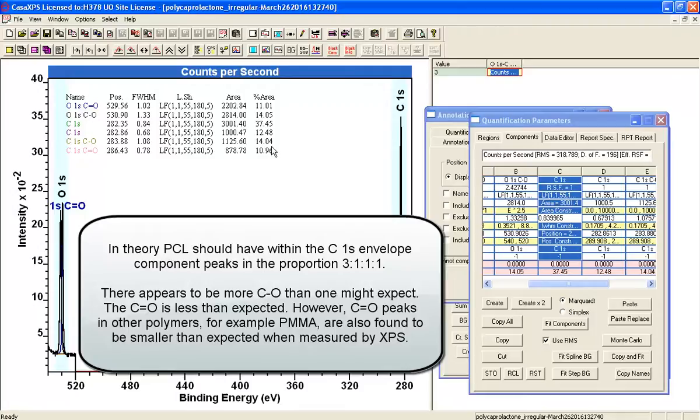In this particular material, they ought to be about the same in principle, but XPS is measuring them to be different. And that's now a challenge to try and understand why that should be the case.